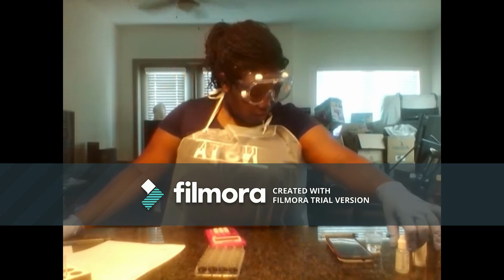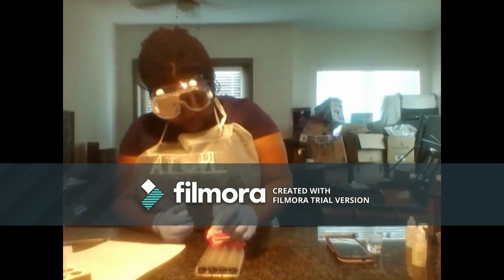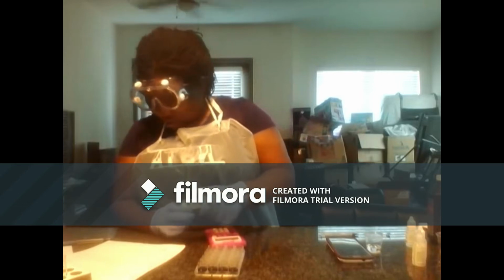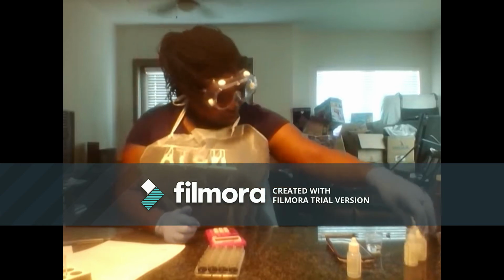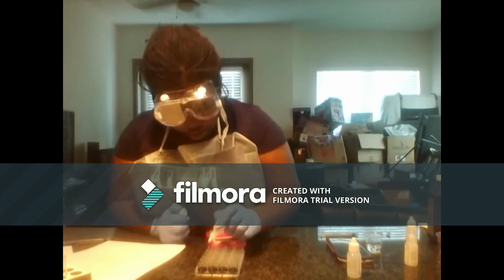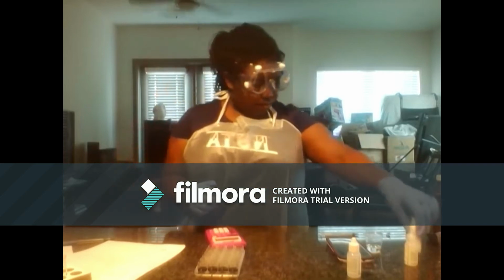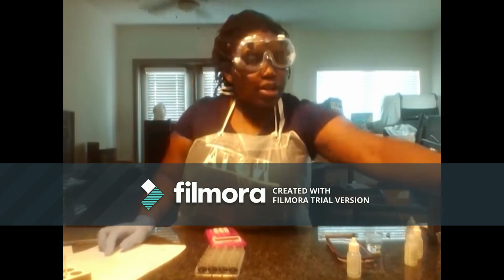So potassium iodide, 2 drops. And 2 drops of hydrochloric acid. And 4 drops of starch solution. And 6 drops of water.